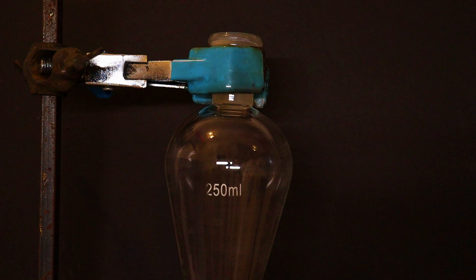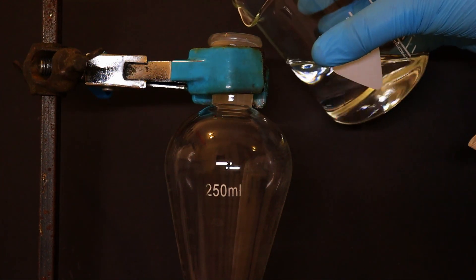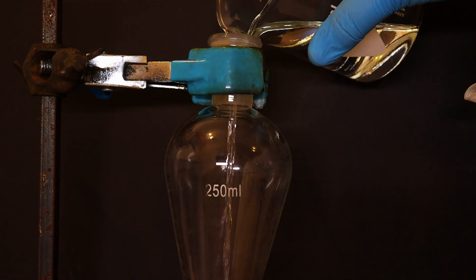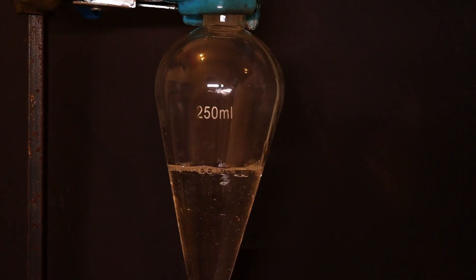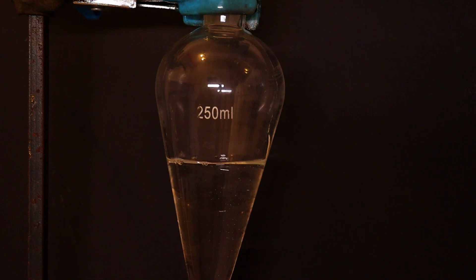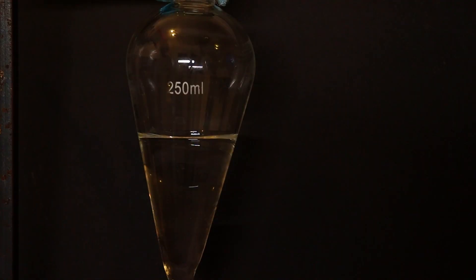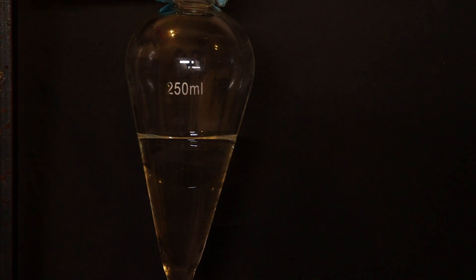Then, we need to take a 250 milliliter separatory funnel and pour in 85 milliliters of concentrated hydrochloric acid, and then we need to pour in that 25 grams of tertiary butanol that we measured out earlier.